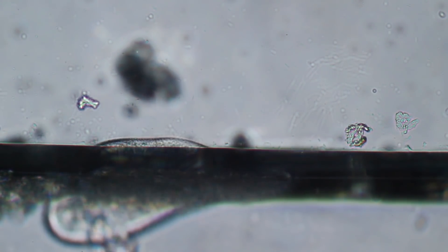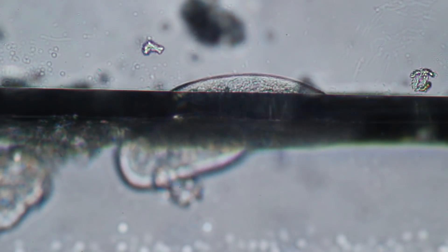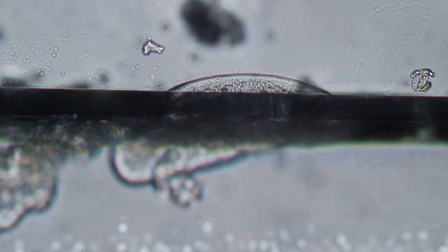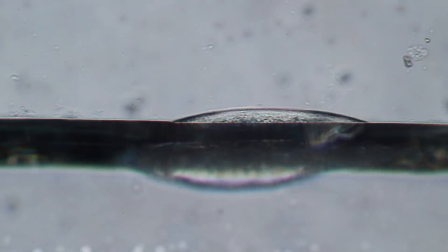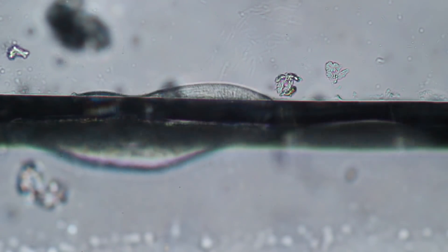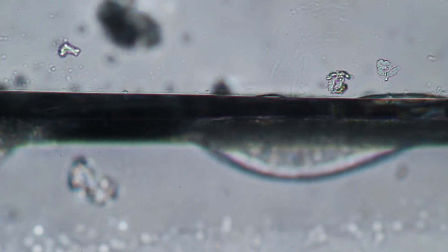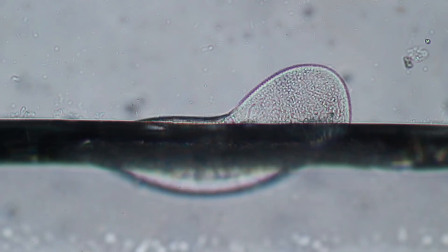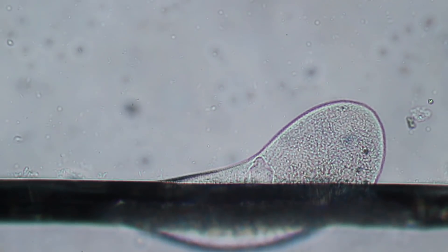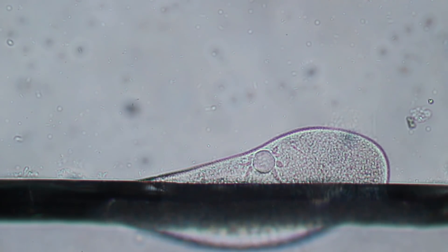So it's trying to find a way out here, moving back and forth, trying to go the other direction. Still doesn't work. The edge of the cover glass appears to be quite thick because of the difference in refractive index. You can see it's moving back and forth. There are also other smaller animals that have absolutely no problem passing this barrier, but this Paramecium really is not very successful. It's giving it another try — okay, it's a tight squeeze. Does it work? It doesn't quite work.